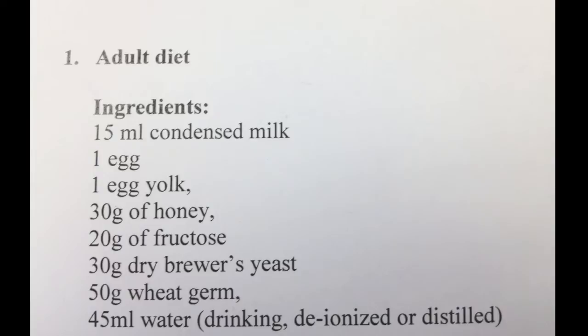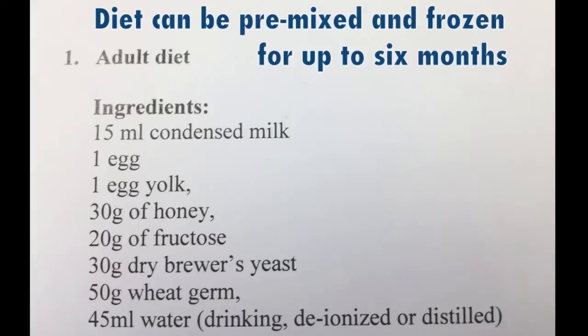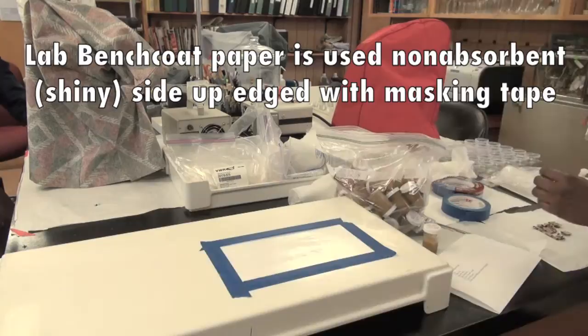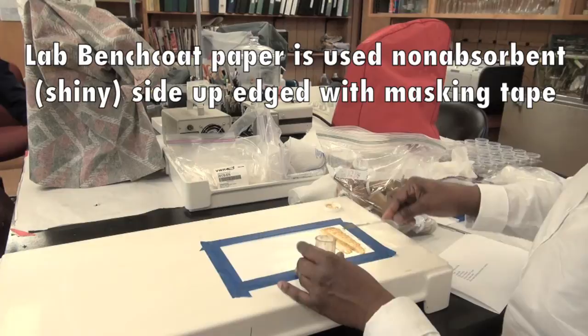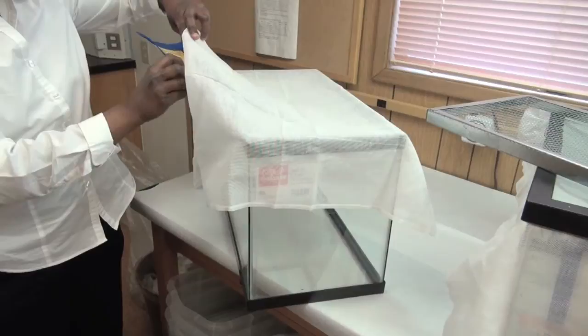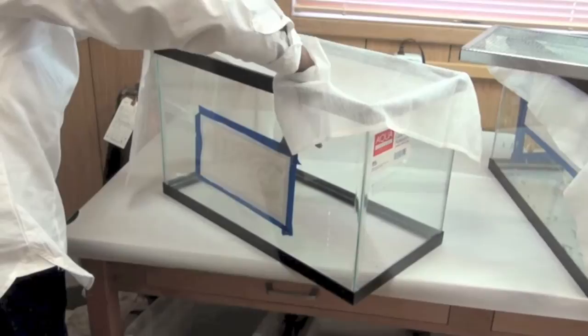The adult diet can be prepared using the following recipe, adopted from the International Organization for Biological Control. To deliver the diet to the lacewing adults, we use a rectangular piece of laboratory bench paper and blue masking tape along each edge. The diet is then spread all across the non-absorbent surface of the bench paper. The sheet containing the diet is then carefully placed into the rearing unit and affixed to the sidewalls using the masking tape.